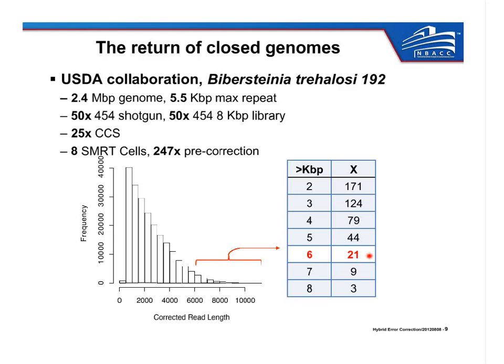So the algorithm used is a seed and extend strategy. It's not a standalone aligner like Bowtie or BWA. It's part of the Celera Assembler's overlapping module, which has been around since the days of Sanger. But it just uses a hash seed and extend method, which pretty much all of the typical short read aligners use these days. What was the second half of that one?